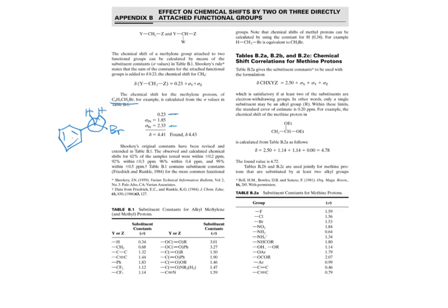2.33 for the bromine. For the phenyl group, it's right here, 1.8. They put 1.85 up there. It says 1.83 down here. So I don't know why that is. But essentially they add these up, comes up with 4.41, and then they say, oh, the actual value is 4.43. So it came pretty close.